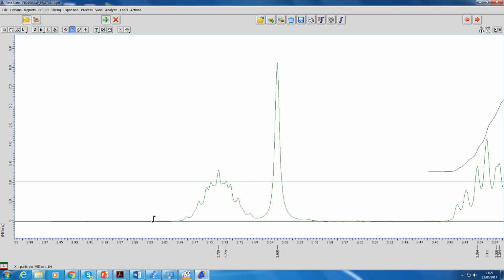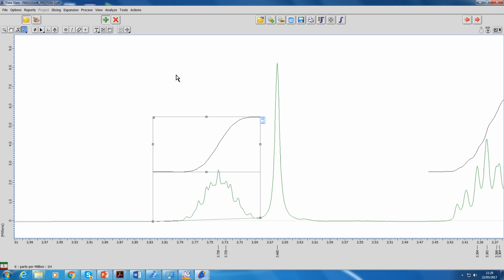So we can start on the bottom left, drag it across until we're halfway between the 2 peaks, so you get 0.29, you can just let go of the mouse there, and then we can draw another one for this peak. So select halfway between the 2 peaks again, oops, alright, drags that one. Don't want to do that. I think if you just select and then click somewhere else, then just repeat it.